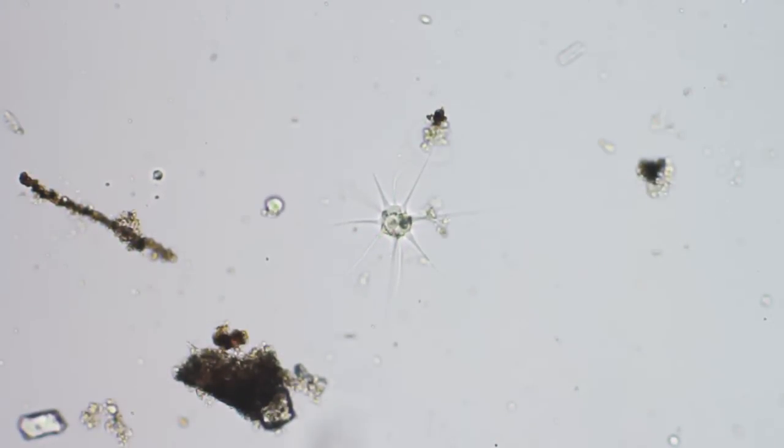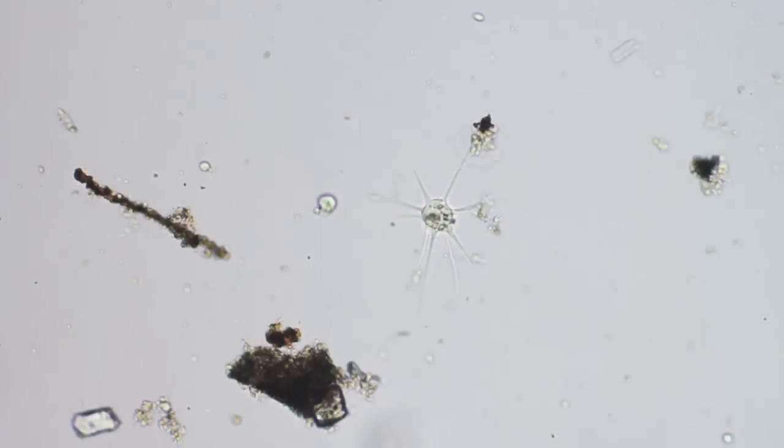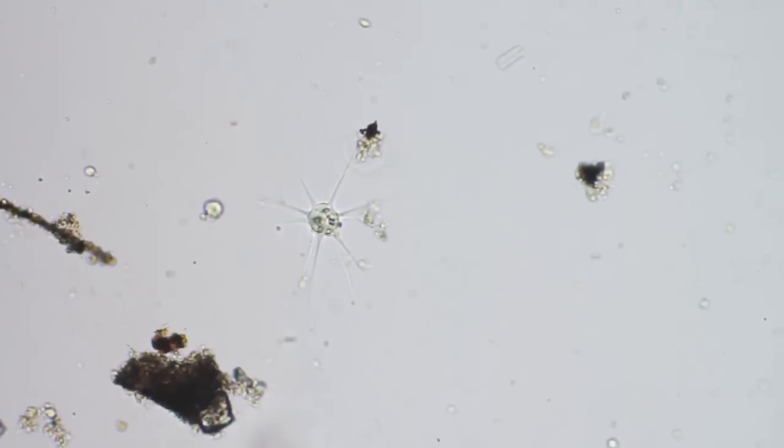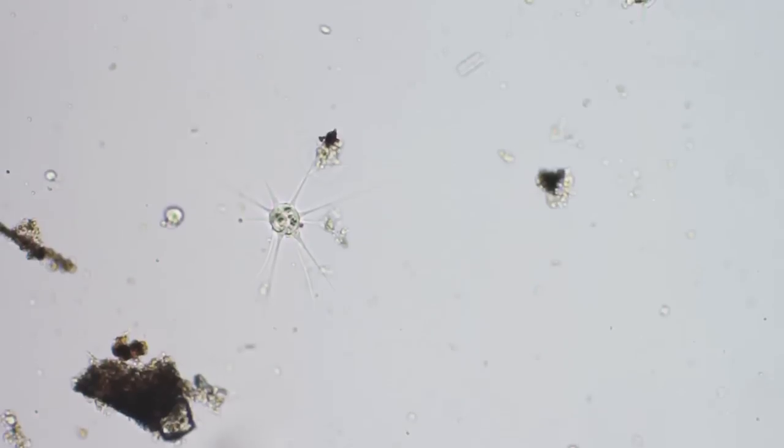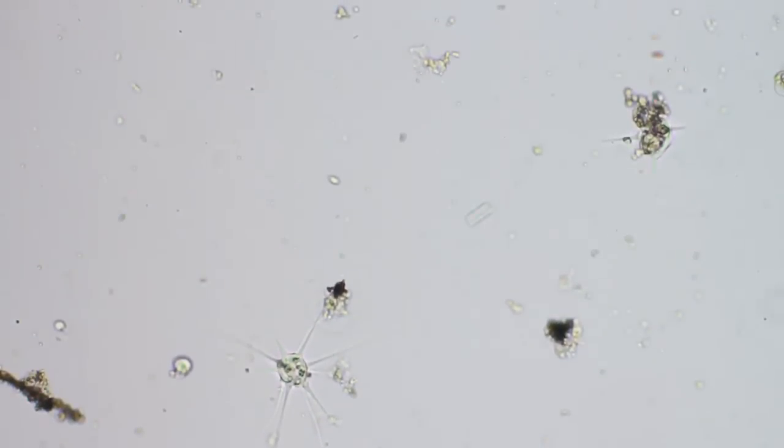This is some kind of a star-shaped amoeba. There's another type of amoeba up here in the top right corner. Let me see if I can get them both in there. I don't want to lose the star because I've never seen one.